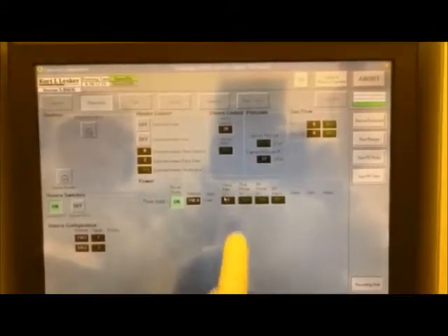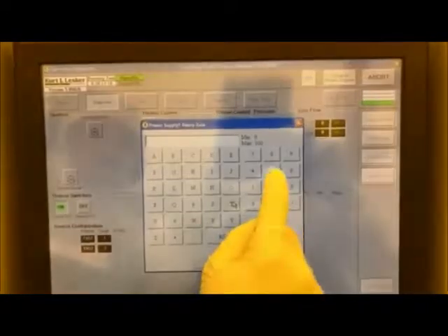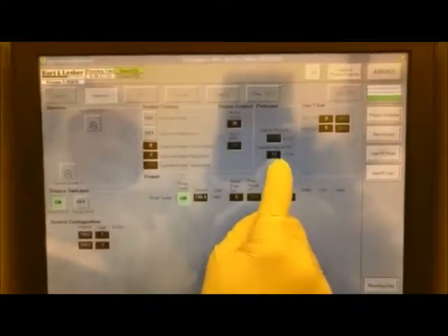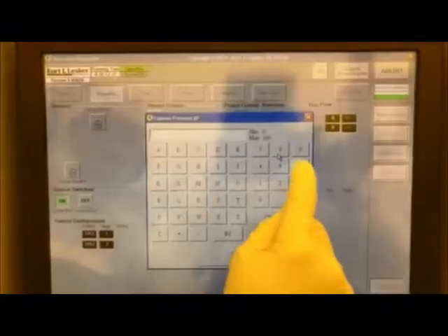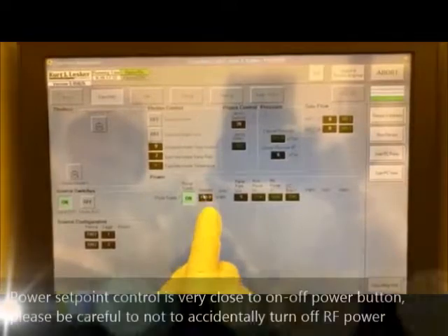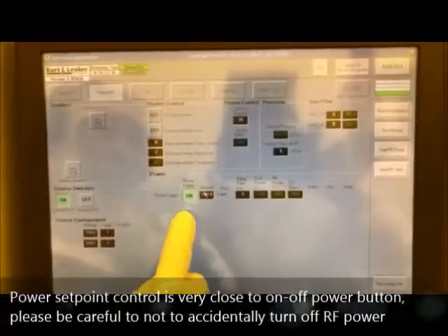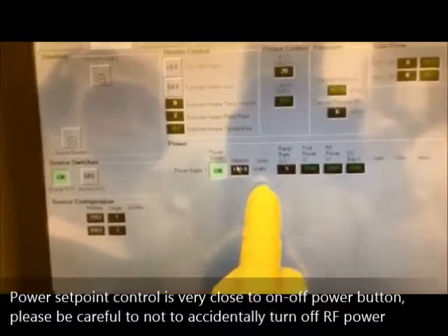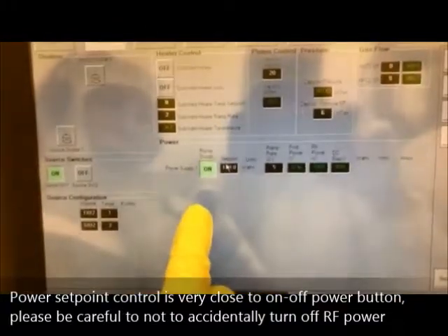Press the ramp, set it to 5, and we set the pressure. Again, drop by half. This time will be 6. And set point increase. Make sure the set point and the power supply on/off button are very close, so make sure you don't accidentally shut off the high power.